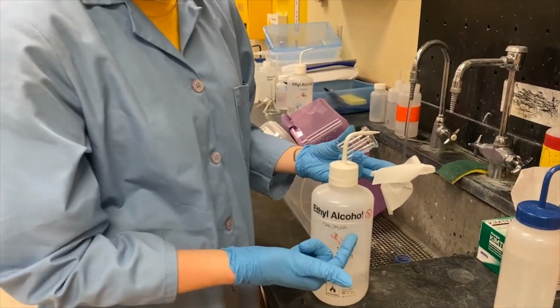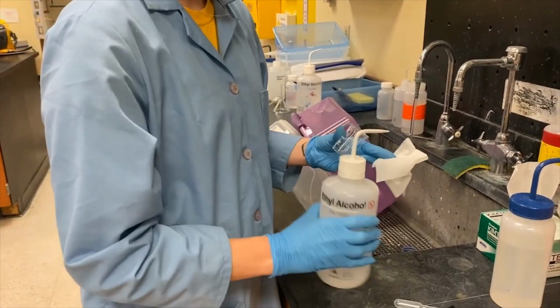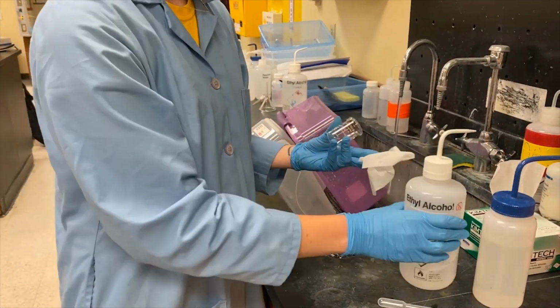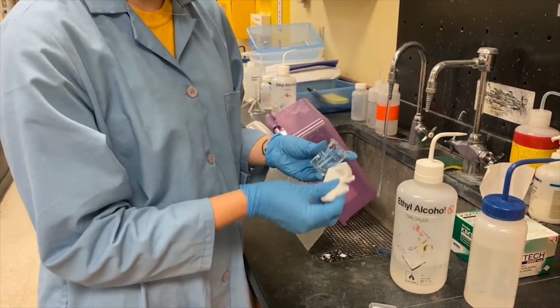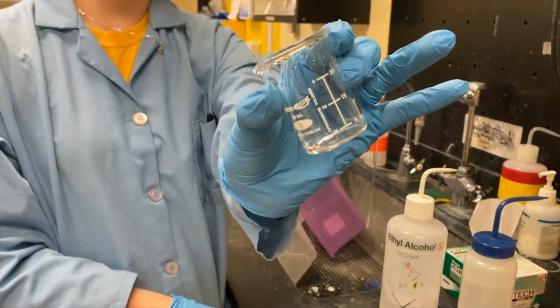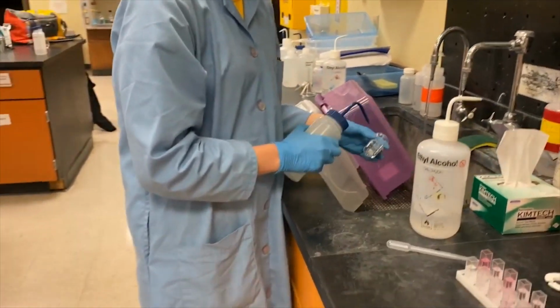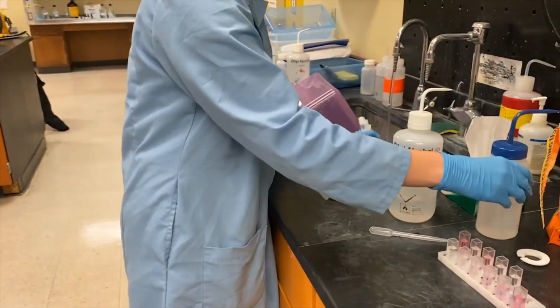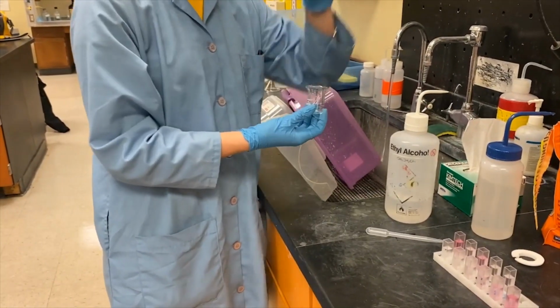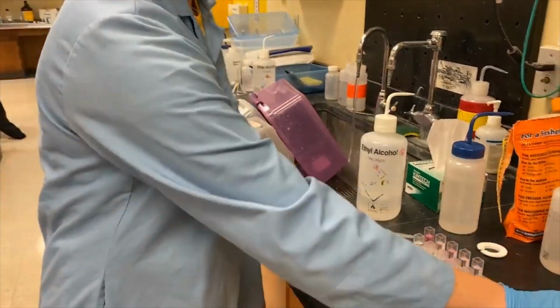So today we're going to use ethyl alcohol. You can also use isopropyl alcohol or acetone. I'm going to squirt a little on a Kim wipe here. Don't need too much, and it wipes away like it was never there. Then we're going to just rinse it with our DI water one more time. We can dry off the outside and then put it back on our glassware rack to dry off later.